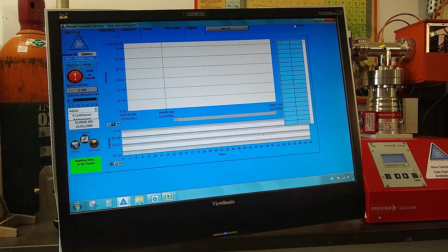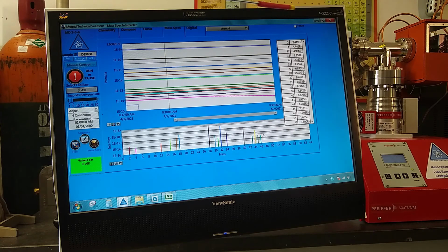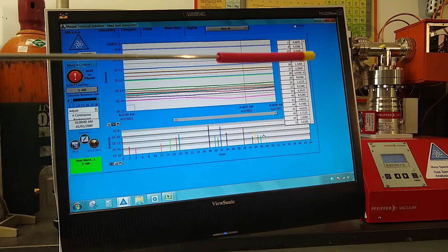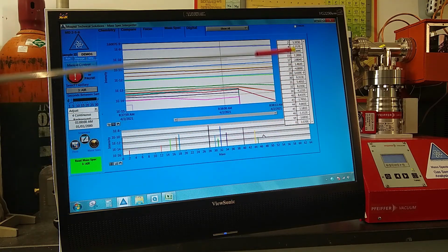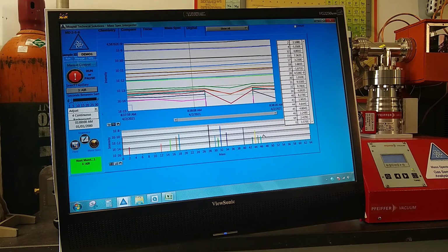At this point, the mass spec is getting its instructions from the computer as far as the configuration. The inlet module is being configured by the computer to tell it which capillary to sample, number 3 in this case. And we're bringing in the data from the mass spec, which is that mass to charge data, the mass unit compared to the ion current detected from each.